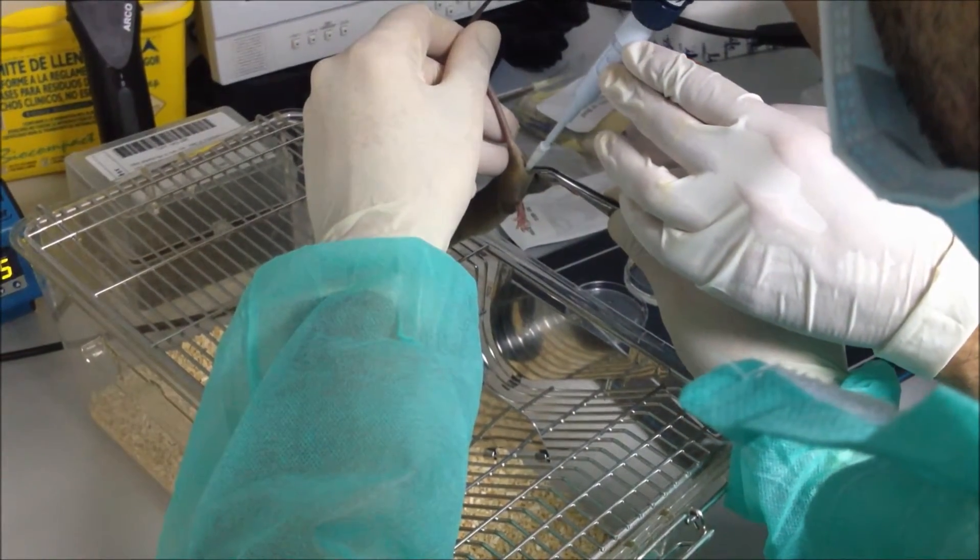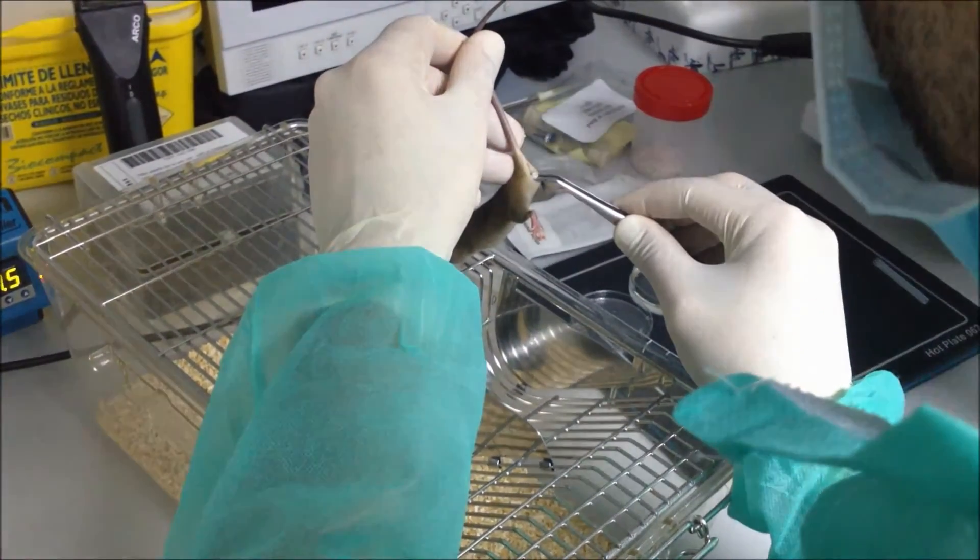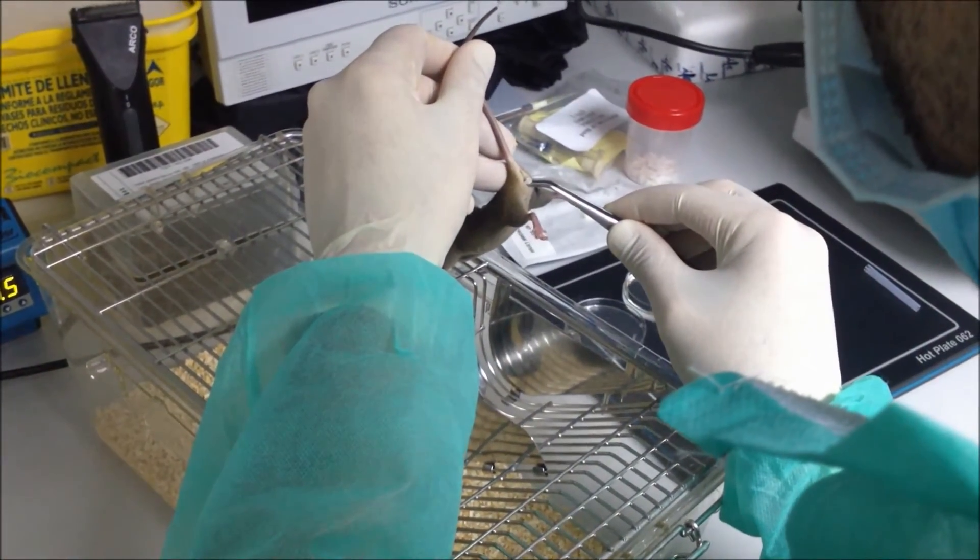Finally, the mice are returned to their cage and the pregnancy is allowed to progress. Optionally, if you want to assess 7.5 day developing embryos, you should sacrifice the mice on Thursday.